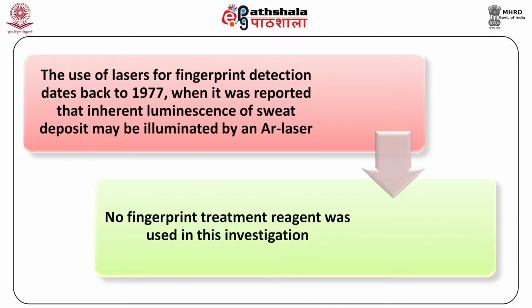The use of lasers for fingerprint detection dates back to 1977, when it was reported that inherent luminescence of sweat deposit may be illuminated by an argon laser. No fingerprint treatment reagent was used in this investigation.